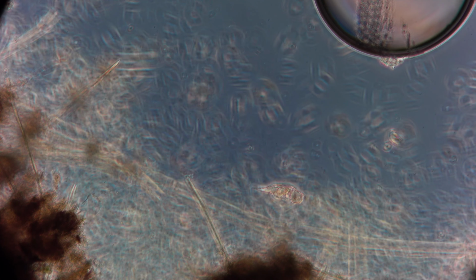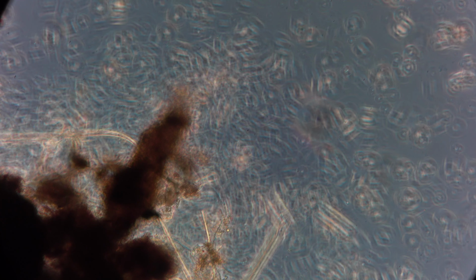Rotifer. So are rotifers mainly what Cricket studies, or a lot of what she studies? Yeah, she likes rotifers a lot. What are the brainless things that still learn? One of the main things that she studies. Stentor? Yeah, stentors. I don't know if we'll find those, but we will find other ciliates, which are relatives of stentor.